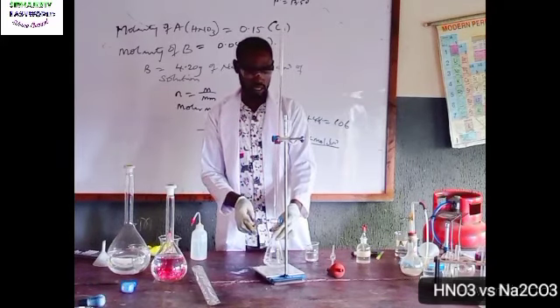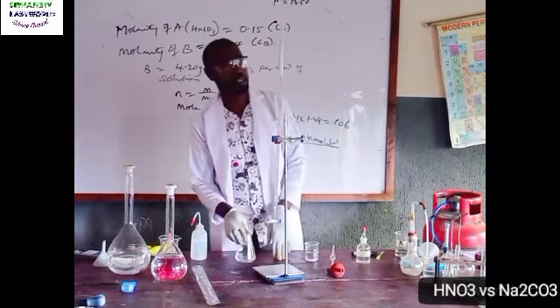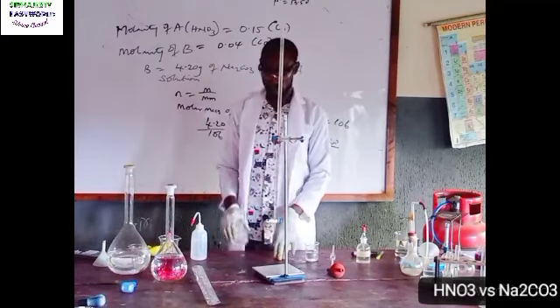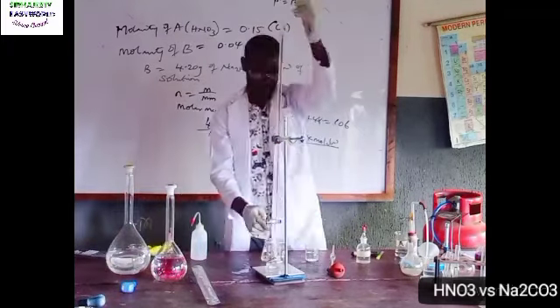see, that's erroneous, that's neutralized even before 9. So phenolphthalein is not acting as a good indicator here. Let me carefully repeat this.